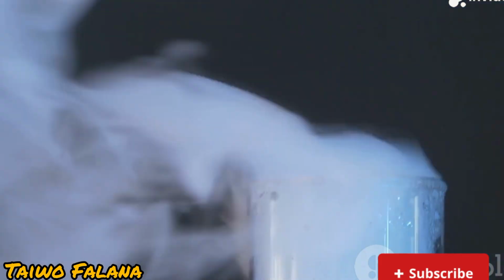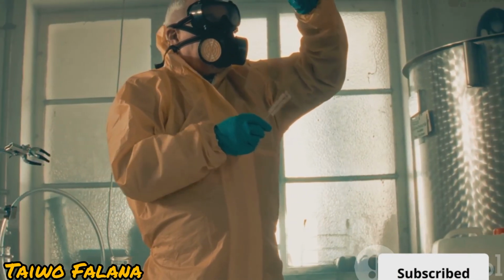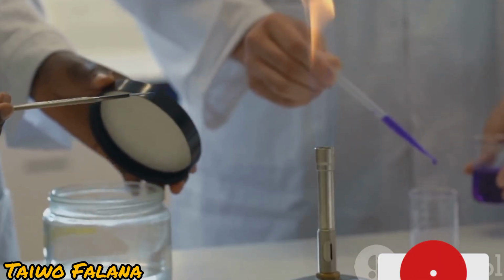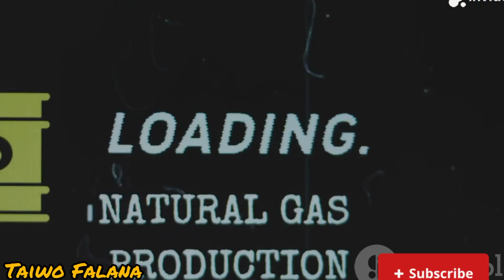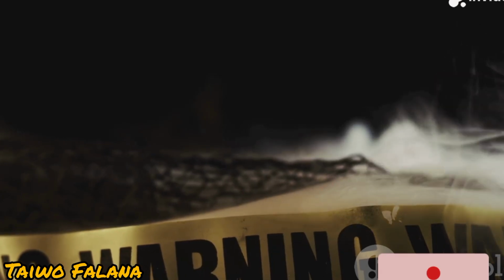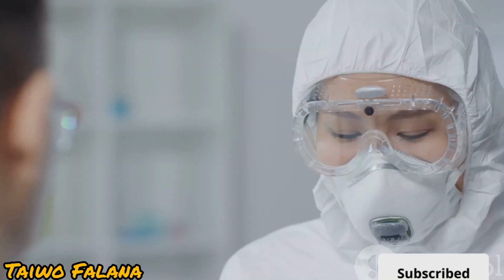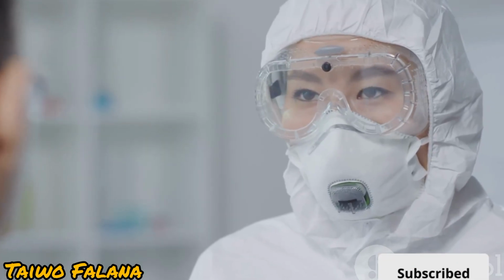Now, for carbon monoxide, CO, this one's trickier and a lot more dangerous. You heat methanoic acid with concentrated sulfuric acid, which acts as a dehydrating agent. The reaction gives you carbon monoxide gas and water. But beware, CO is called the silent killer because it's colorless, odorless, and super toxic. Always ensure good ventilation and don't sniff around.